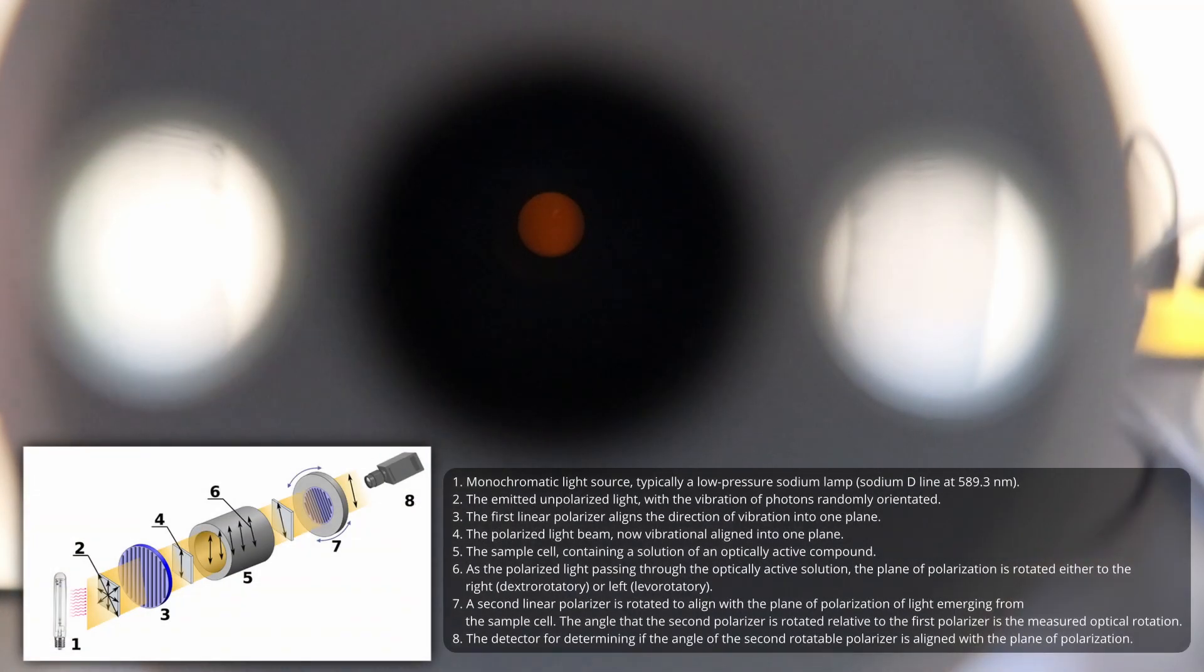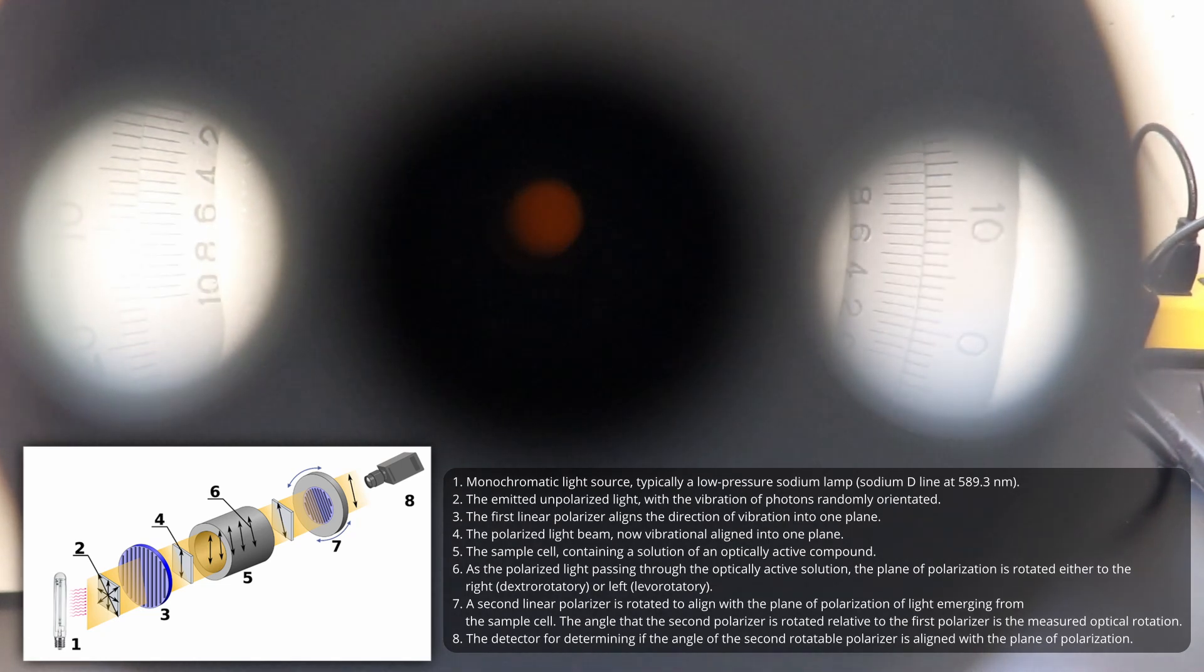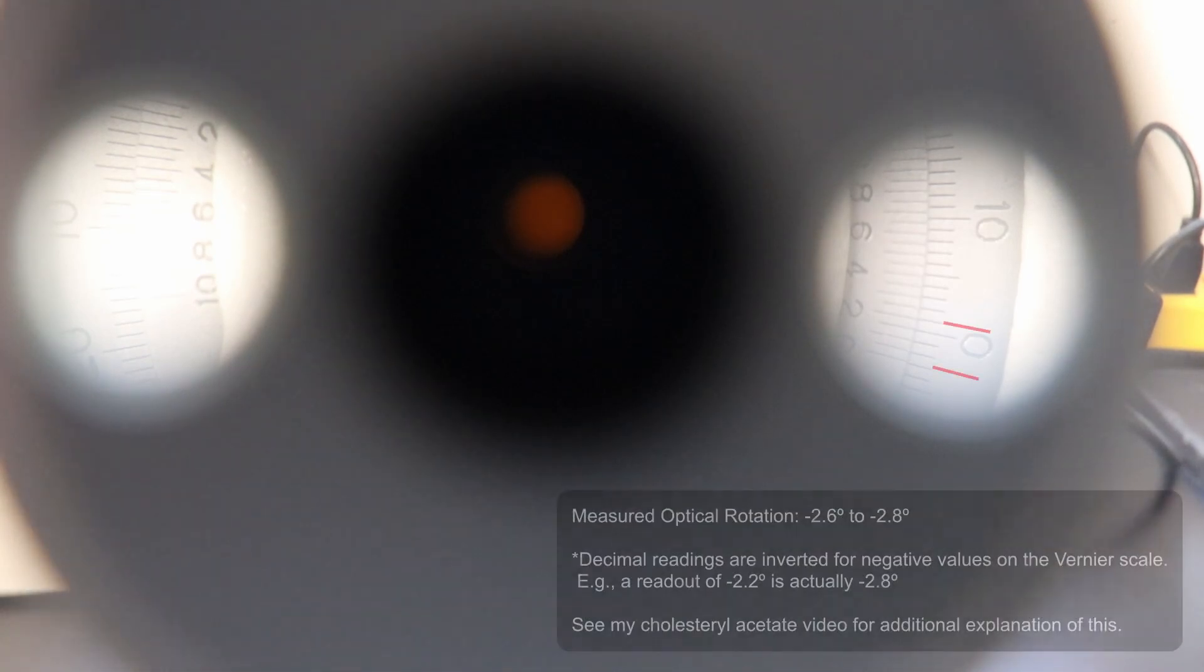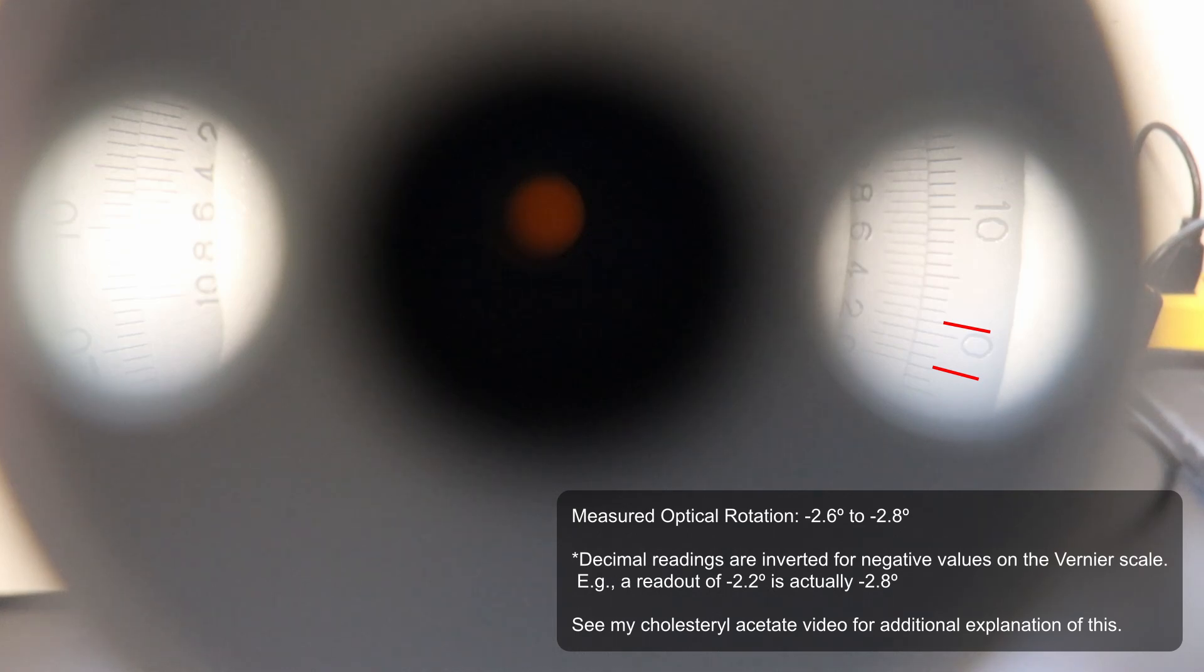At this point, the rotatable polarizer is now aligned with the direction of polarization of the light that is exited from the solution. And as such, the relative angle between the first polarizer and the second rotatable polarizer is the measured optical rotation of the sample.